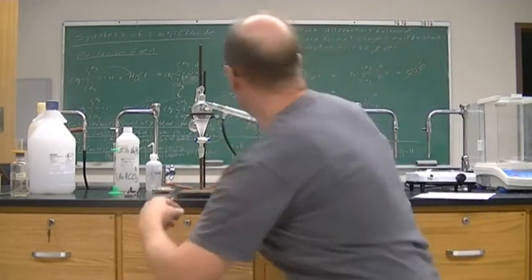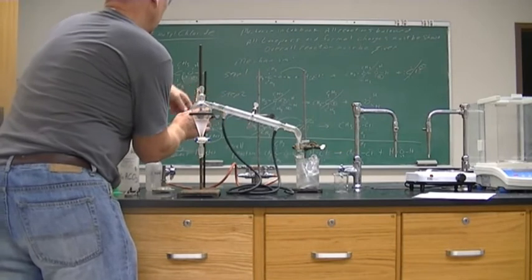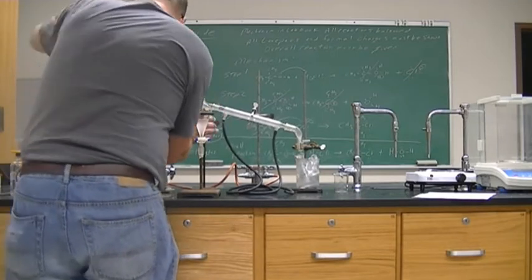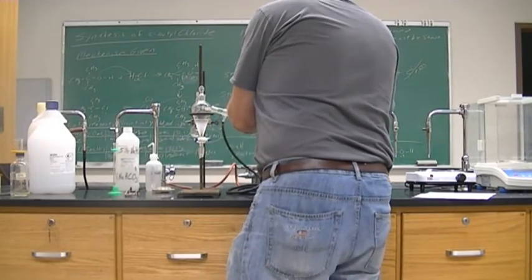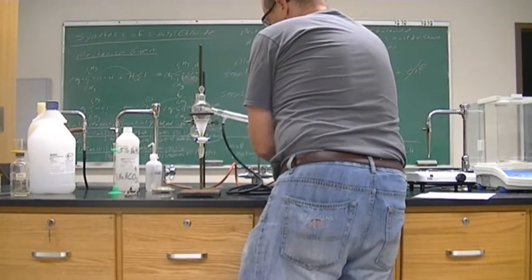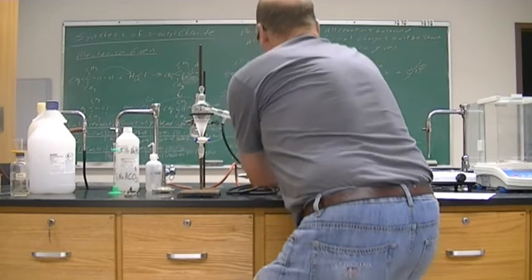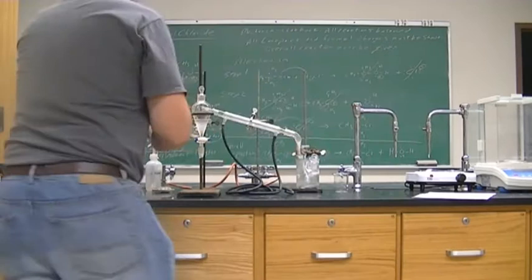So I have to lower this whole apparatus here. All right, so I need to lower the whole thing. So this side has to be lowered. And then the middle has to be lowered. And then this has to be lowered. So it takes some engineering to get this to be at the exact level that you're looking for. All right, down some more. And it's all clamped. It's not going to go anywhere.